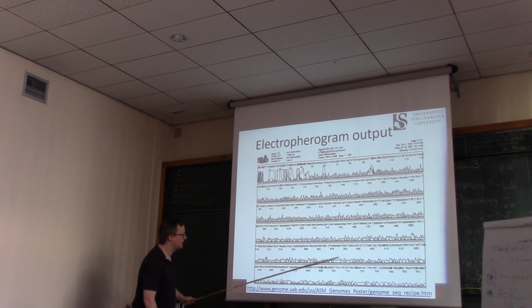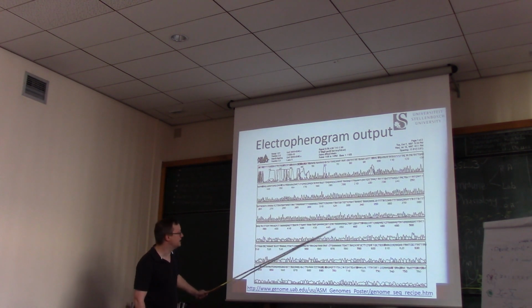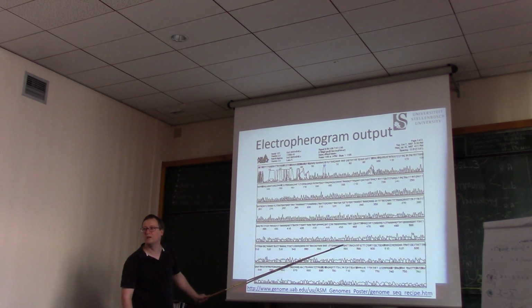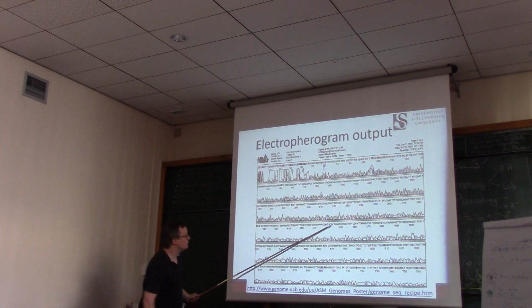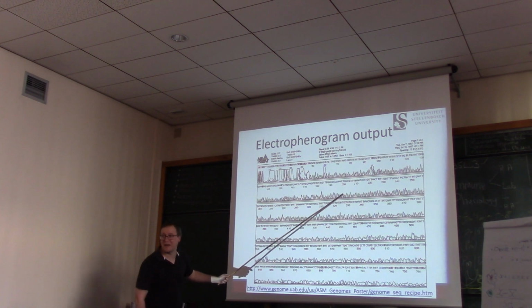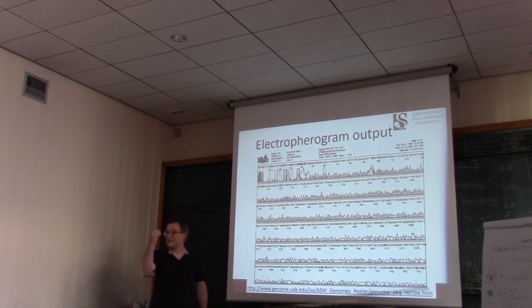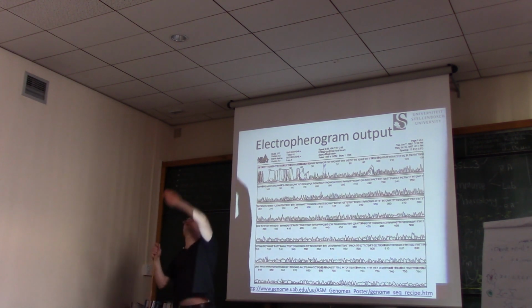Down here at the bottom, we see that we've got pretty good separation in, say, the 300s, but dip down into the 400s, and we no longer have what we call baseline resolution. Have people heard that term? In other words, up here, when green is up and then it comes back up again, it falls all the way down to the baseline.